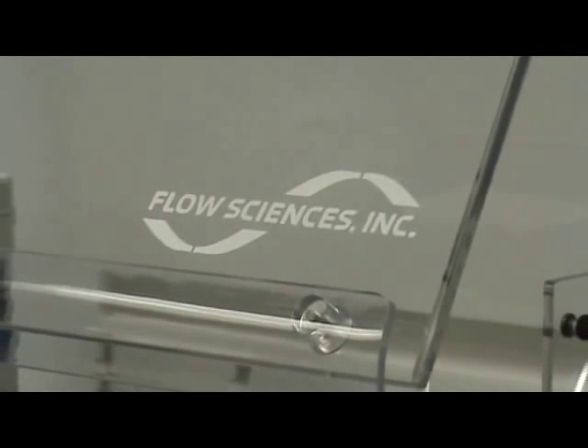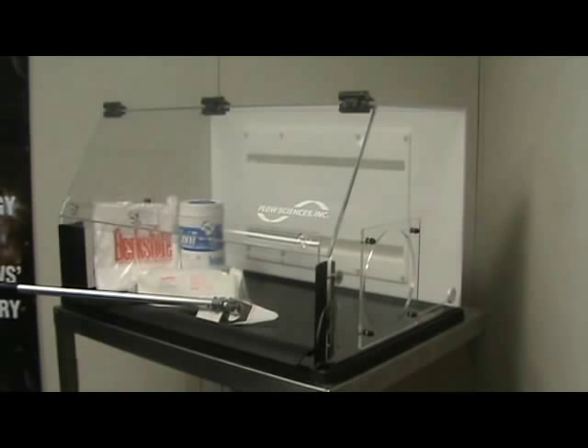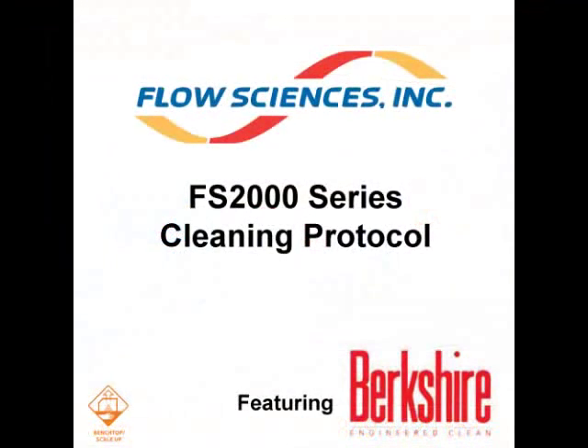Flow Sciences takes a consultative approach with their clients, offering added value, which is why they have partnered in direct collaboration with Berkshire Cleanroom Wipes. Berkshire has developed innovative cleaning solutions to minimize risk in the laboratory for operators and equipment. Flow Sciences and Berkshire have developed a suggested cleaning protocol to minimize contamination. Please consult the supervisor or safety officer for your current good manufacturing process or standard operating procedures concerning cleaning. We hope you find this information valuable.